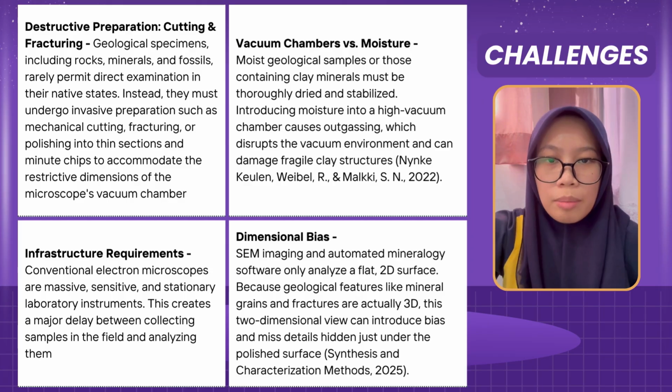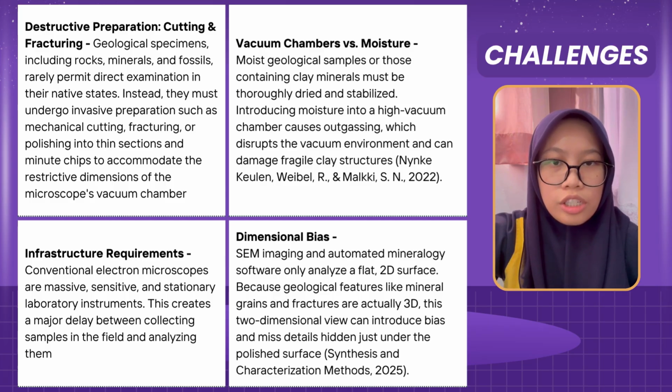Lastly, dimensional bias. SEM imaging and automated mineralogy software only analyze flat 2D surfaces because geological features like mineral grains and fractures are actually 3D. This two-dimensional view can introduce bias and miss hidden details just under the polished surface.